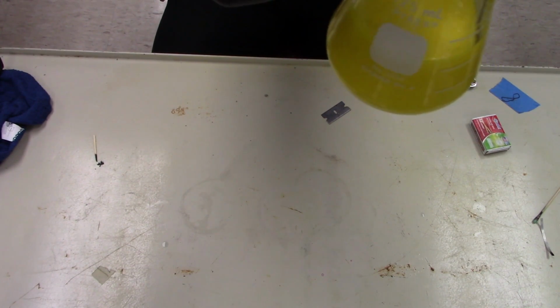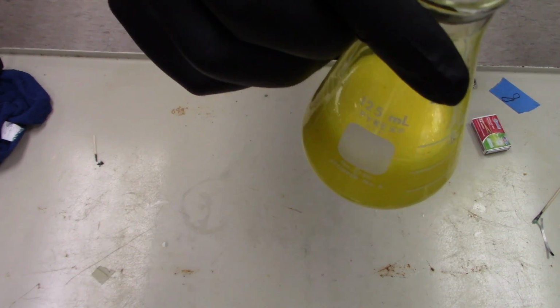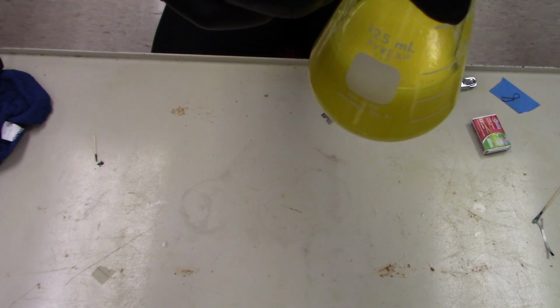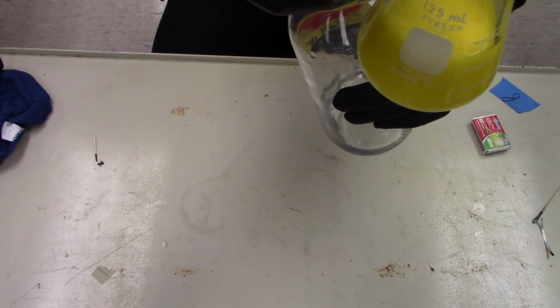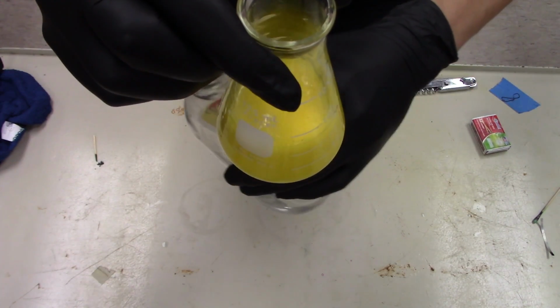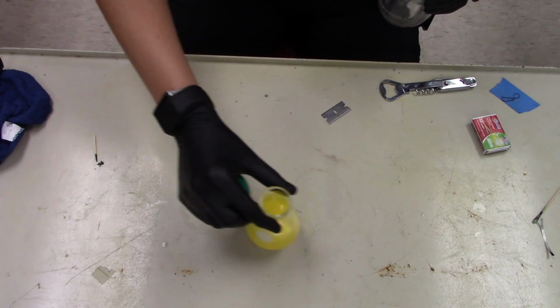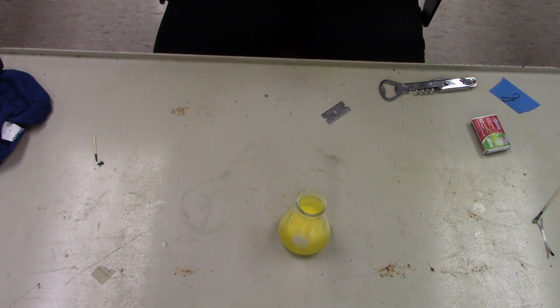Isn't that kind of cool? That yellow cloud that formed there is, I don't know which compound it is, but that's the solid substance. If I let this sit here for a while, we'll just see this chalky yellow layer of stuff on the bottom. That's the solid compound that it made. And then there will be sort of a clear material on top.